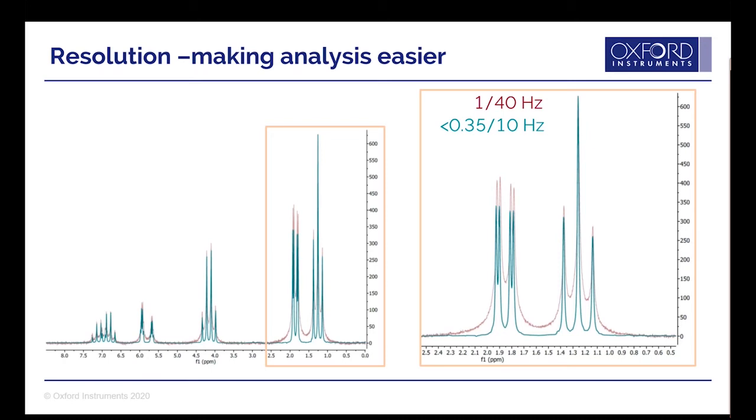At 7 ppm, you can see the group of peaks there. At the original instrument with a half height line width of 1 hertz, a base of 40 hertz, you essentially have something that looks like a bulge with a couple of peaks on the top. With the improved resolution of new systems, actually all those peaks are resolved and you can get right down to the baseline.